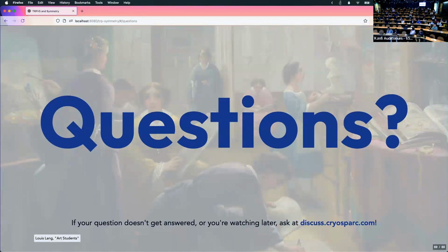The other thing was to add on to this question about regularization. In CryoSPARC, we try as much as possible to look for parameterizations of these algorithms where the parameters have some intuitive or interpretable unit, something that helps you decide how to set parameters that modulate the results to a great degree. This filter resolution is a great example of that. It makes a huge difference to the results, and it's a fundamental question, not just an implementation question. It's really about what size of objects you are looking to separate. So we make that a physical unit, in angstroms or resolution, so that you can tell CryoSPARC you're looking for changes at this size scale or that one. It really is a fundamental question of what you're trying to ask the classification method to do. So just to add on there.